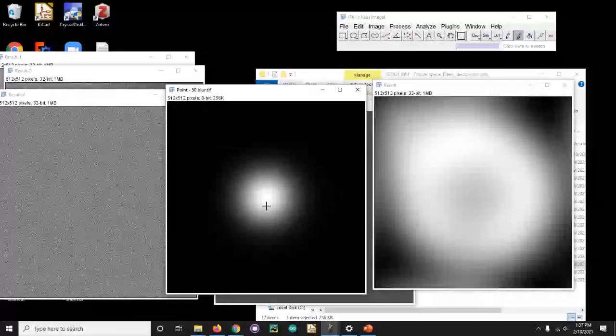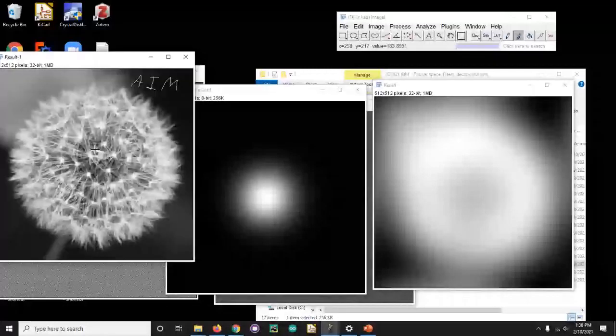So yes, if we could collect billions of photons from every pixel in our image, and then have the point spread function be perfectly uniform across the entire image, and then measure the point spread function at atomic resolution, then mathematically this would happen. But fundamentally, we can't do that.